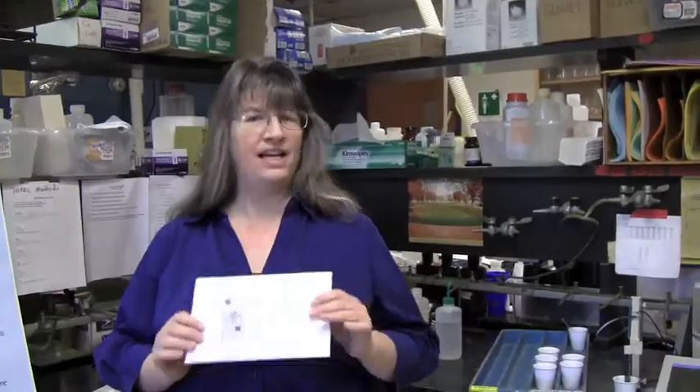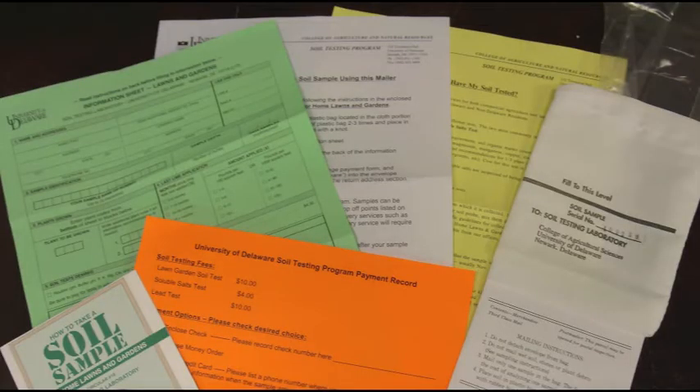At the garden centers, you're likely to see one of our mailer kits. It's a kit that includes the how-to brochure, directions on payment, a sample information sheet, a sample guideline on how to pull an appropriate sample, and the soil test kit. You can then just take your sample, complete the information sheet, and send the sample back with payment to the university through the mail, FedEx, or any other delivery service, or you can just drop it in one of the Cooperative Extension drop boxes.